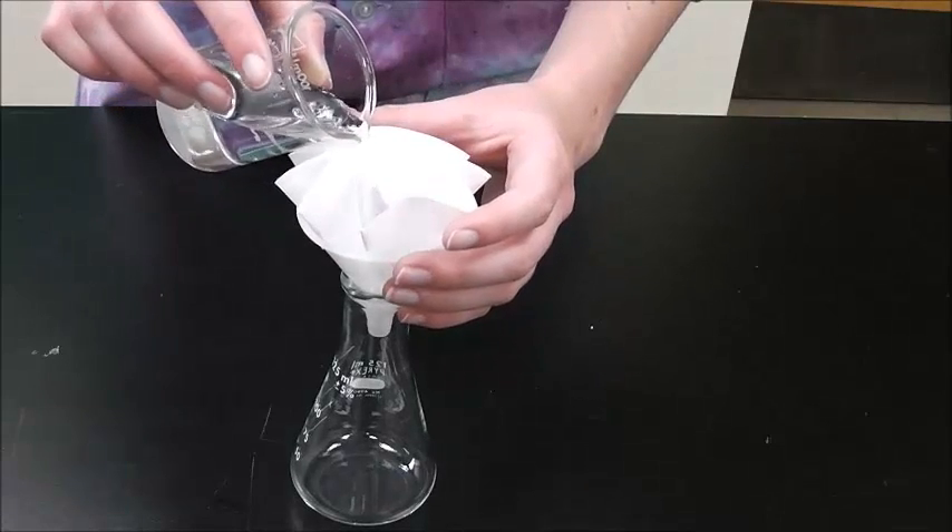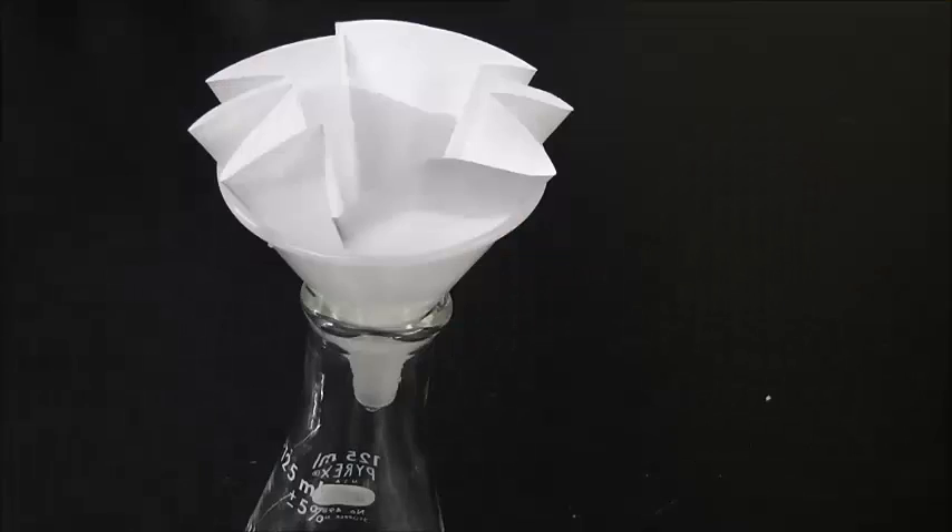Then, you can filter solids out of your liquid by gently pouring your liquid into the filter paper.